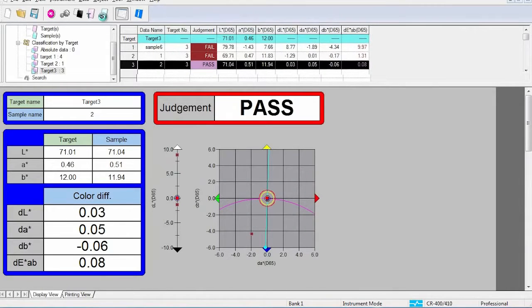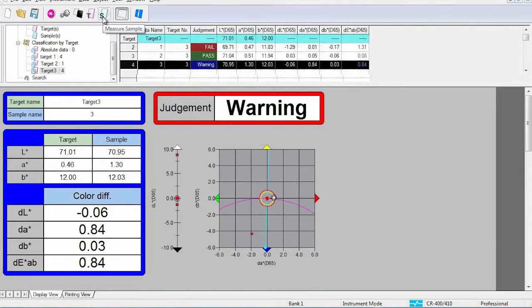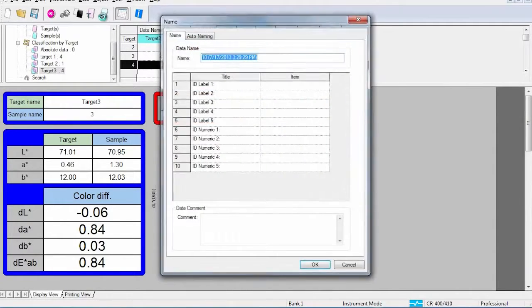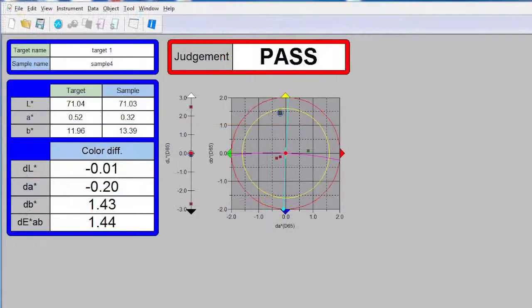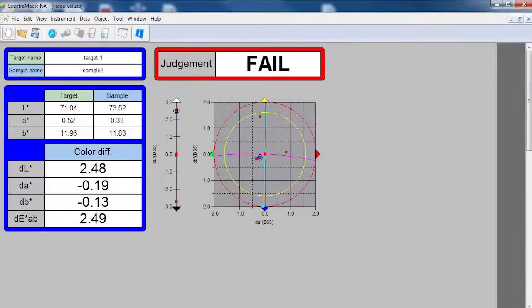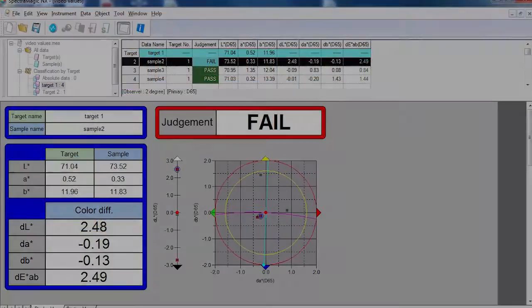When used in conjunction with the CR400 series, SpectraMagic NX offers predefined screen templates for pass-fail assessment, statistical process control, and sophisticated R&D analysis. A wide variety of graphs can be utilized in order to illustrate information. Pre-configured templates are available and can be customized to display information easily and efficiently.